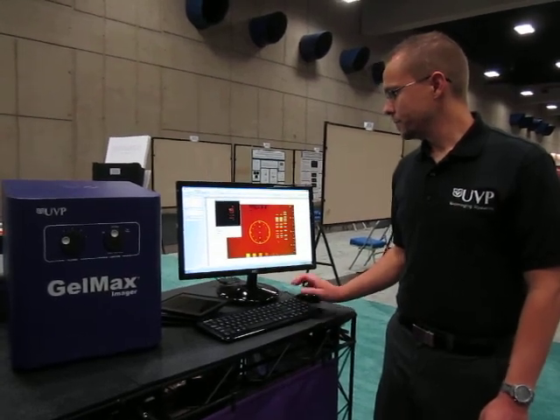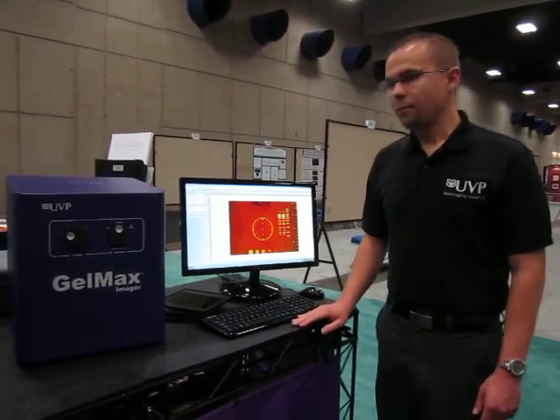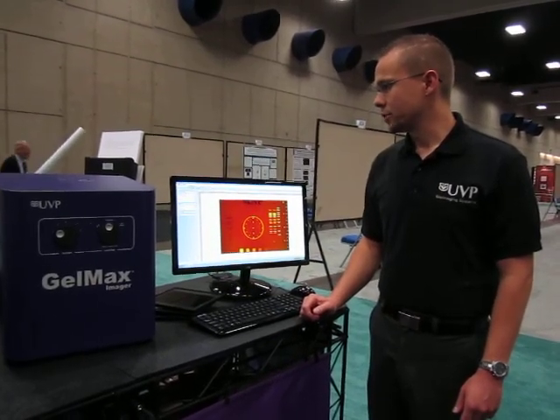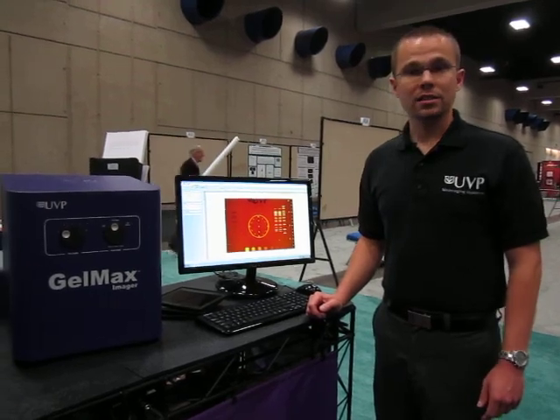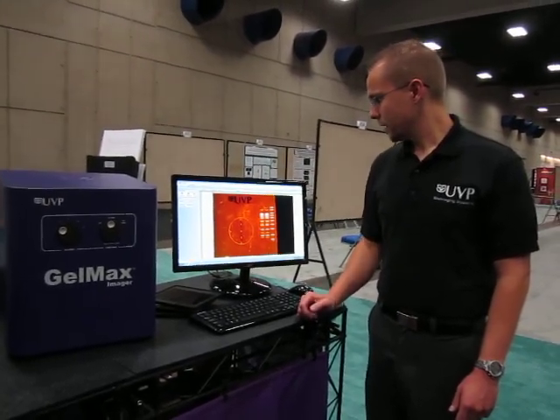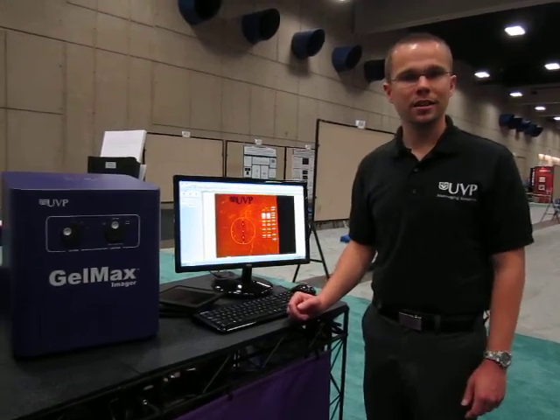Simply click Capture, and within about 10 seconds, the system will show the gel on the screen as a completed captured image for later analysis or publication purposes. There's our completed sample right there on the screen.